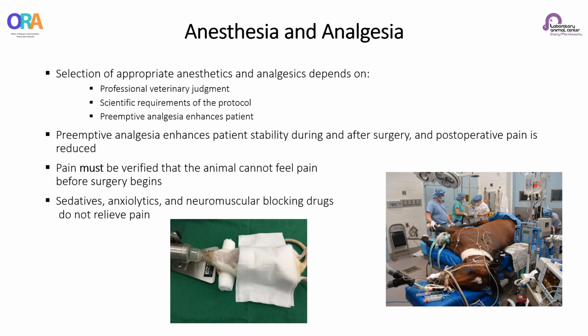When an anesthetic is administered, consciousness is lost before perception of pain is lost. Therefore, it must be verified that the animal cannot feel pain before surgery begins. Personnel may need to test more than one pain reflex response.